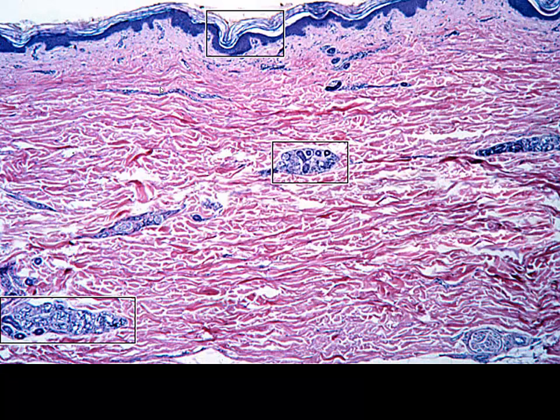All right, once again, reticular layer all over the place. We can see our papillary layer here before we get to our epidermis. Here we're getting into some eccrine sweat glands. The darker structures with the bright, prominent little white spots, those are going to be the ducts. We can see part of those ducts creeping up there.